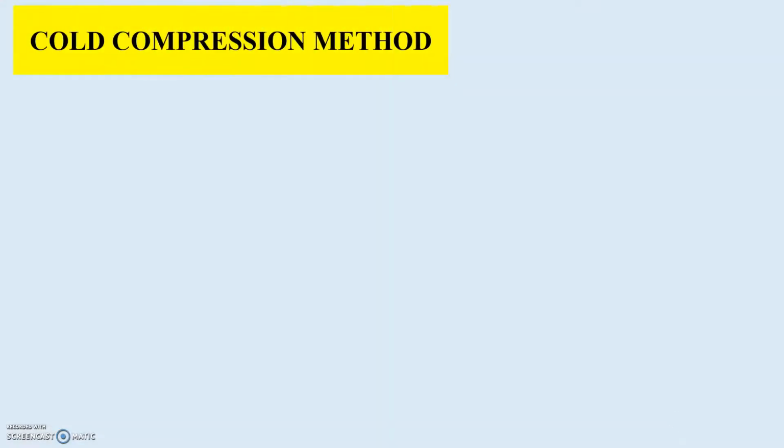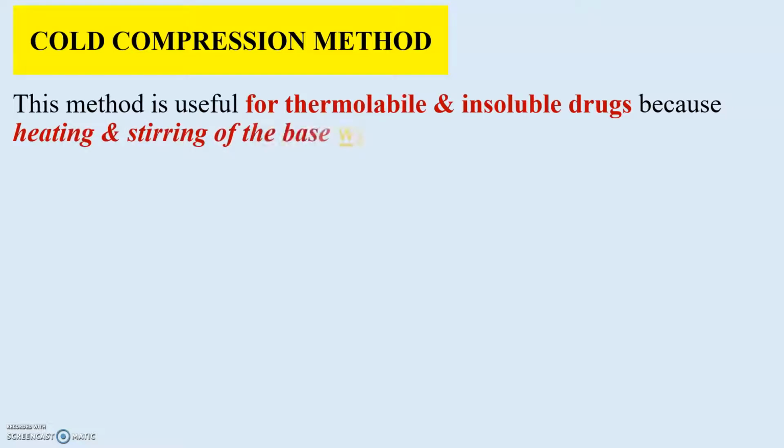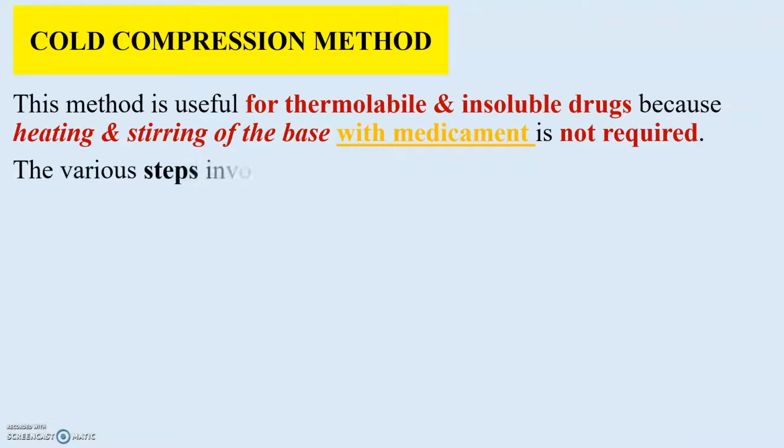Now let us study the cold compression method. This method is useful for thermolabile and insoluble drugs because heating and stirring of the base with medicament is not required. The various steps involved in this method are. Now let us see the different steps involved.